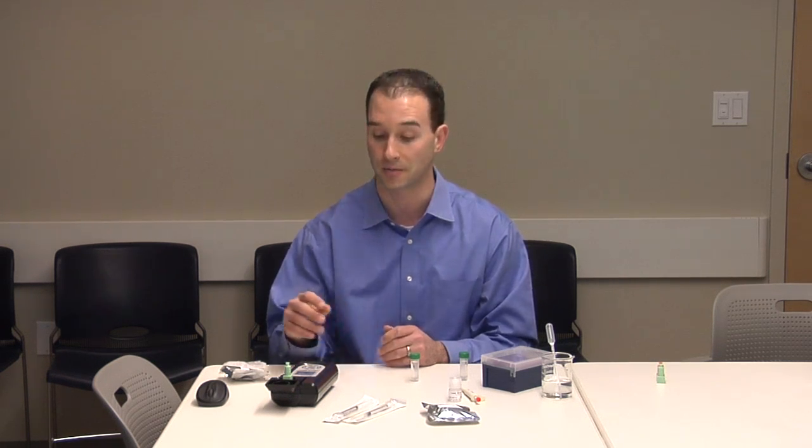If you are adding a new site, select the site screen and select New Site. Enter the name of your new site and save. If you are recalibrating a site, select the site in the menu and scroll left or right to calibrate and select. Both methods are explained in the manual. Once either of these has been completed, the site calibration screen will appear, indicating step 1 of 2. Do not press start until the sample is ready.